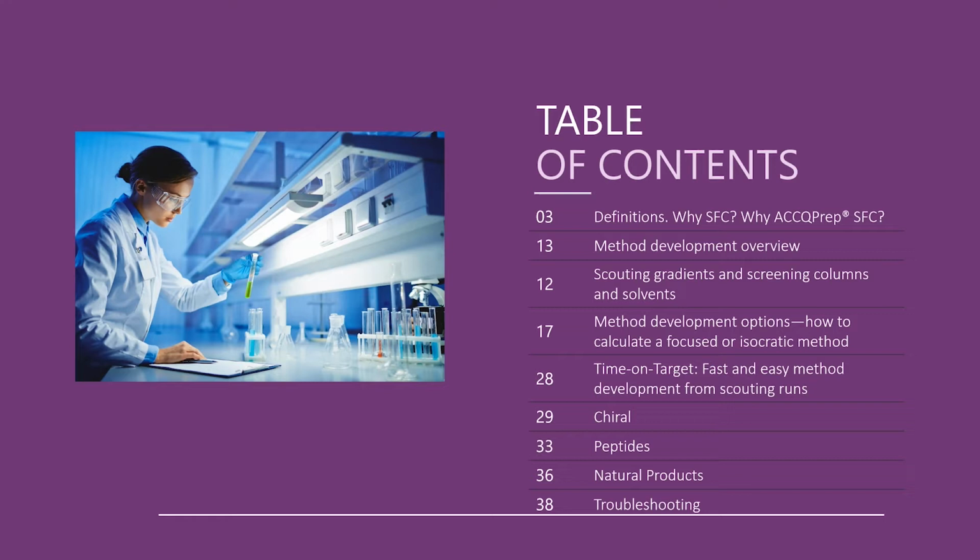We will introduce a new method for determining these gradients from scouting runs that is faster and more accurate than existing techniques, using examples from chiral chromatography, and explore achiral compounds such as peptides and natural products.